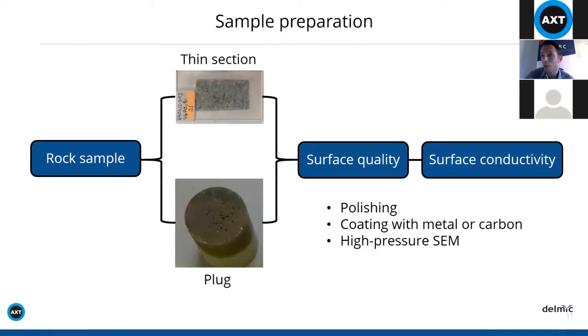But you can have a thickness which is still enough for a good transmission, but also good surface conductivity. Another approach is to have an SEM in which you can increase the chamber pressure to do environmental SEM. In that case, you can also mitigate charging effects, and you can get rid of the charge more easily from the surface.